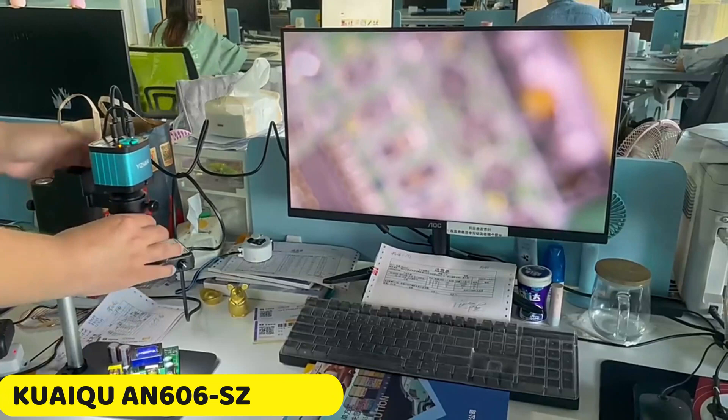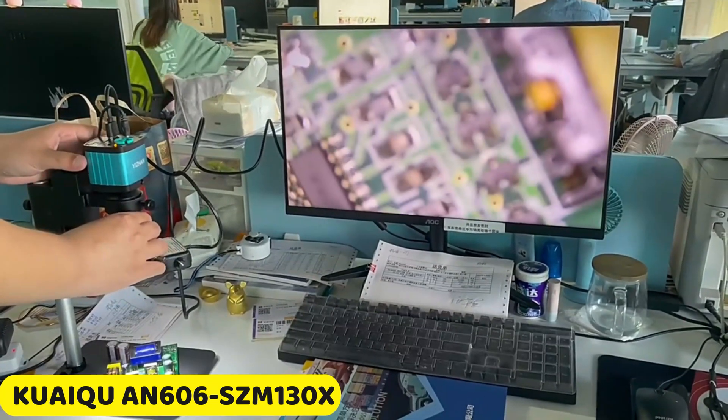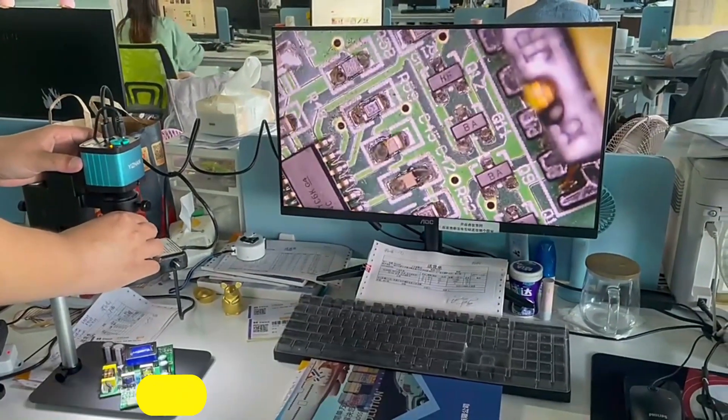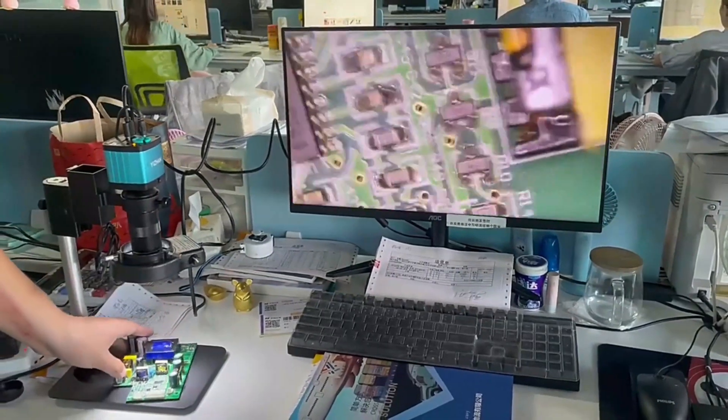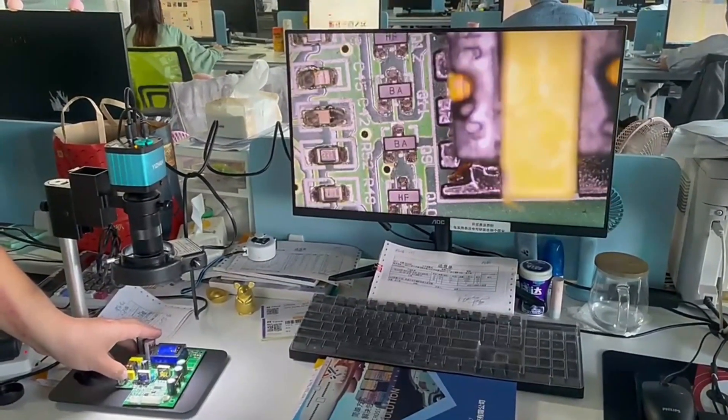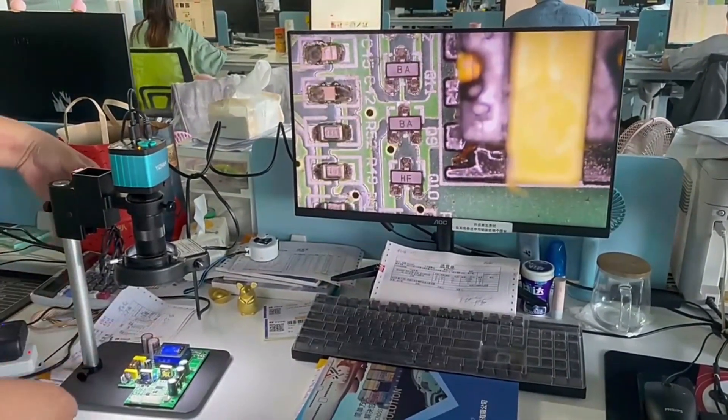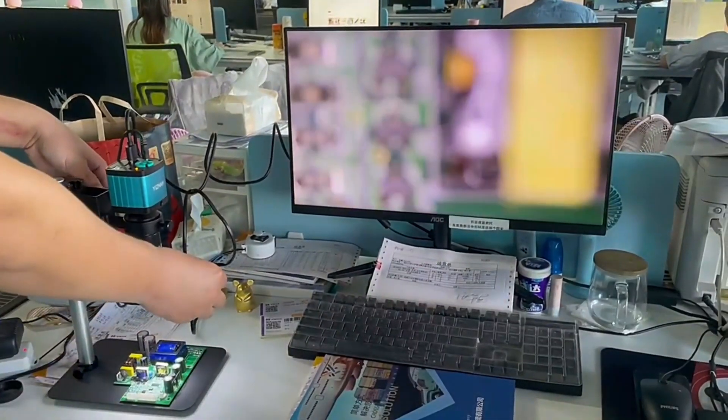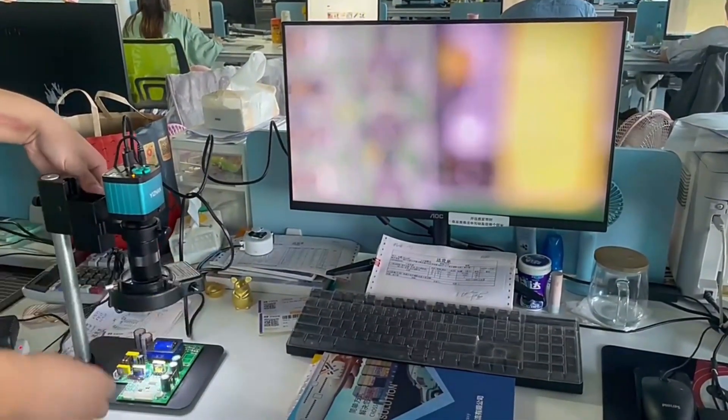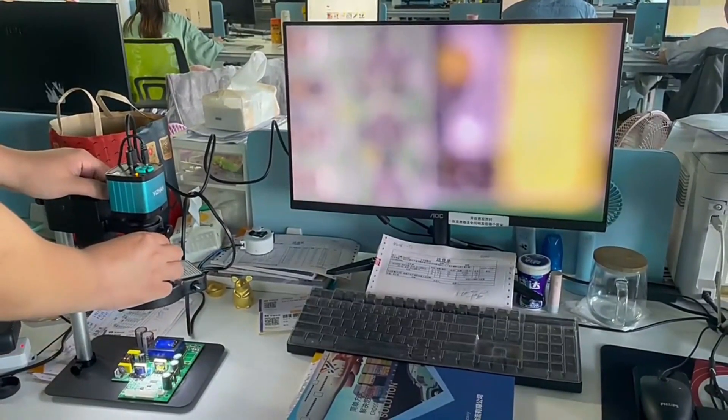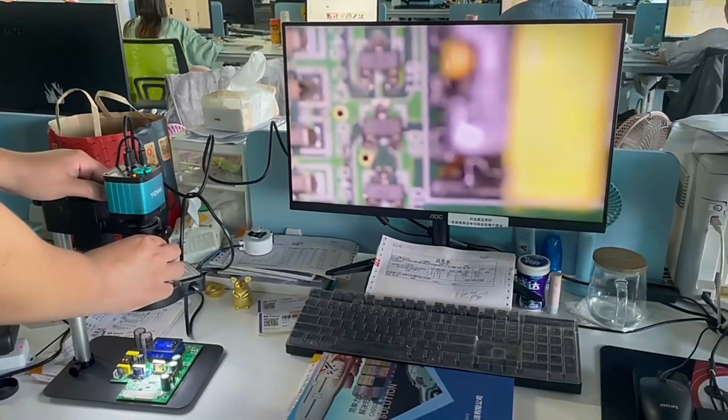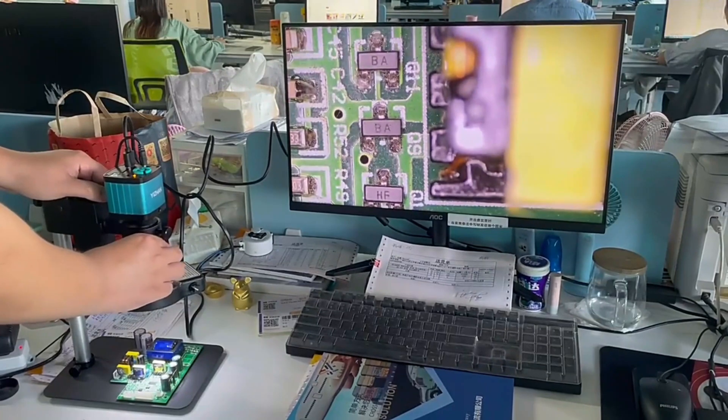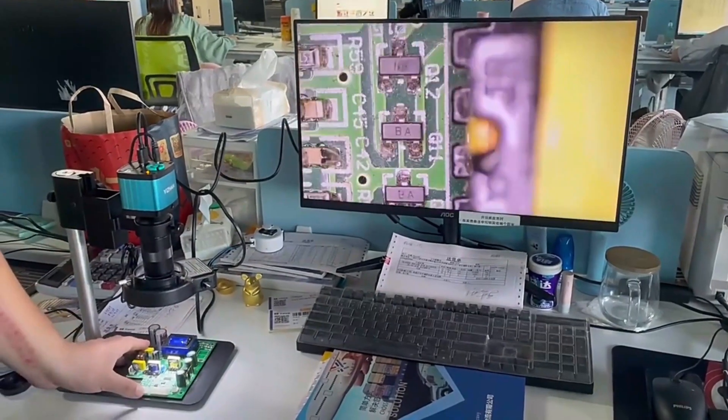Number 5: KUIKU AN-606SZ-M130X Digital Microscope. The KUIKU AN-606SZ-M130X Digital Microscope is a versatile tool with an impressive working distance of 50mm to 155mm, making it suitable for various tasks. Its zoom C-mount lens with a magnification power of 8x to 130x provides clear images, making it suitable for both professional and hobbyist use.